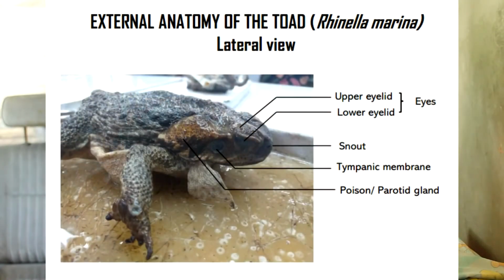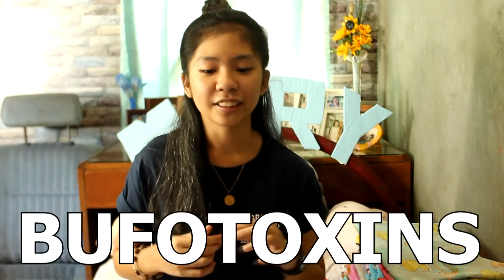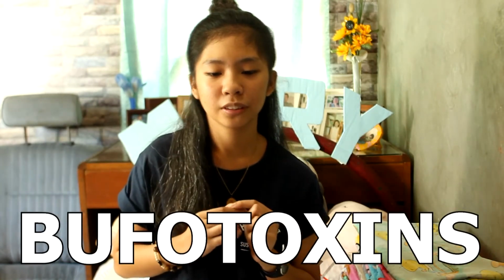The parotid glands are the external skin on the back and shoulders of toads that secrete a number of milky alkaloid substances known collectively as bufotoxins that act as neurotoxins to deter predation. So that is their defense.